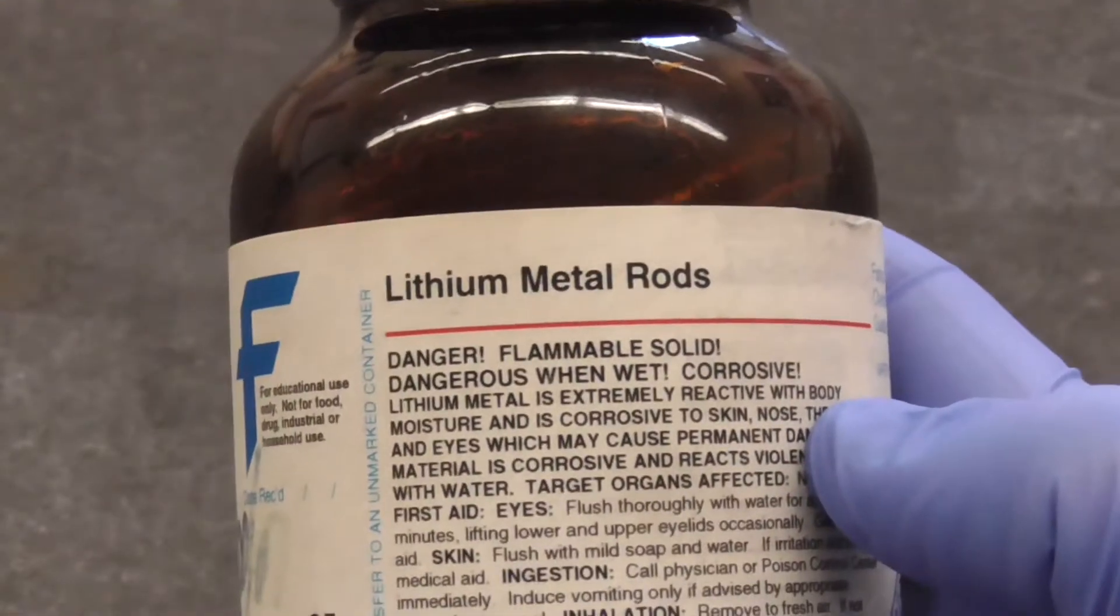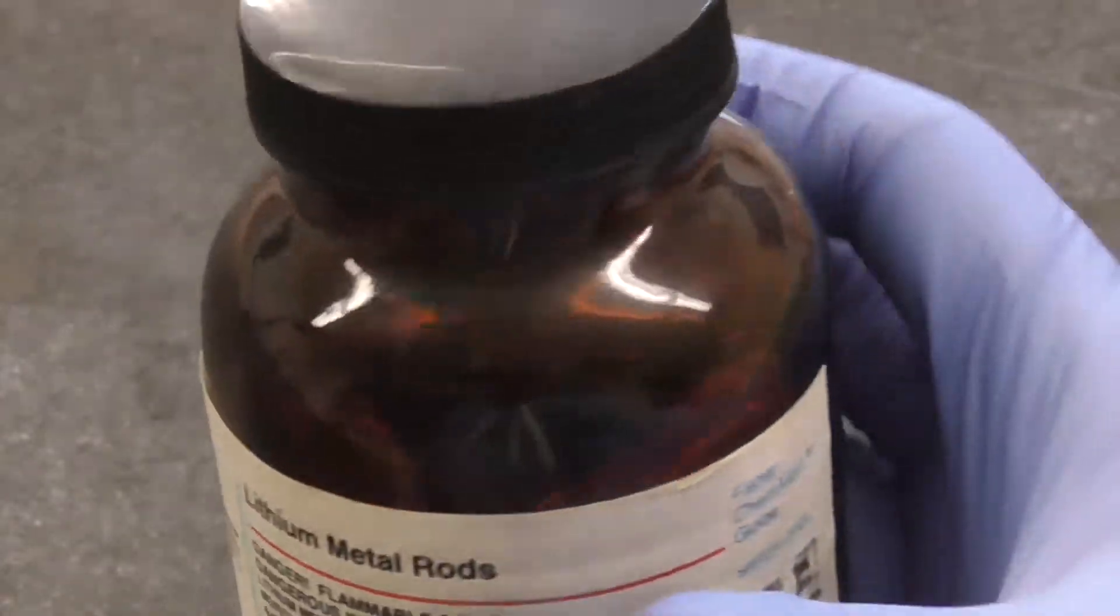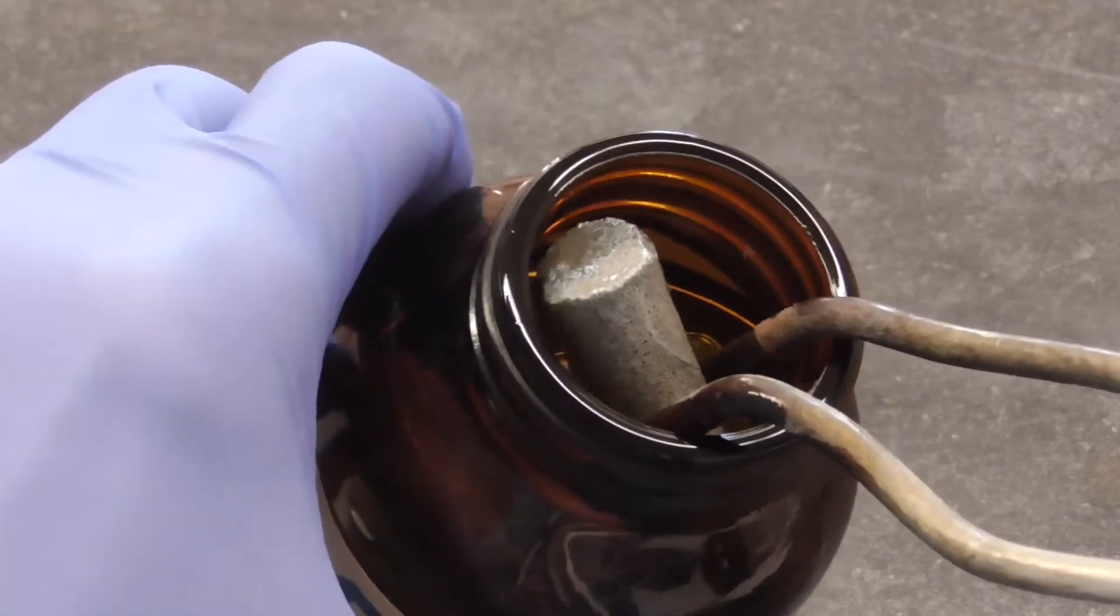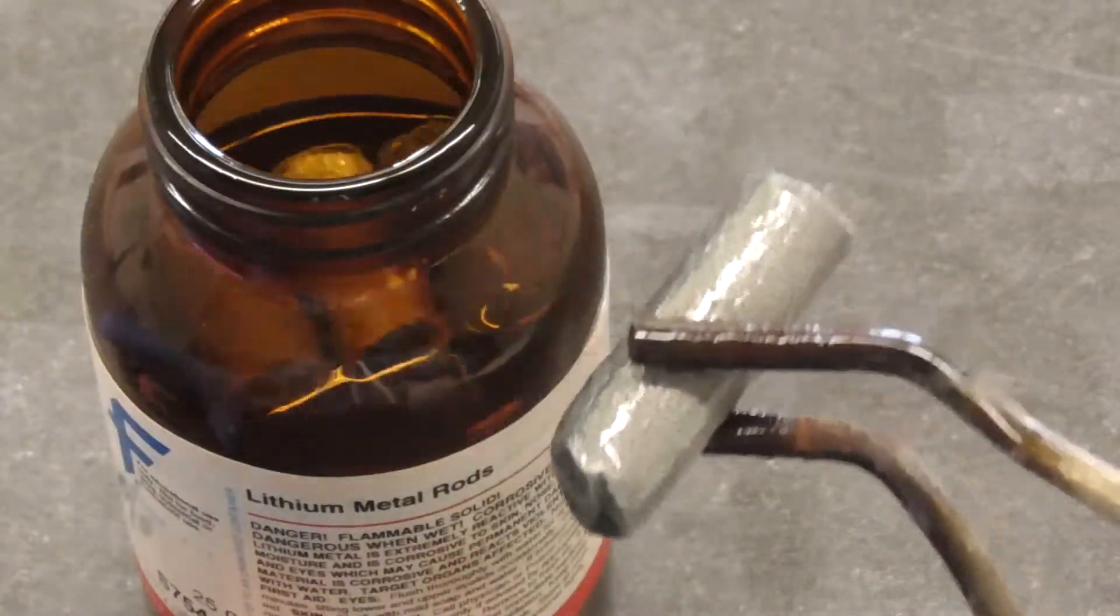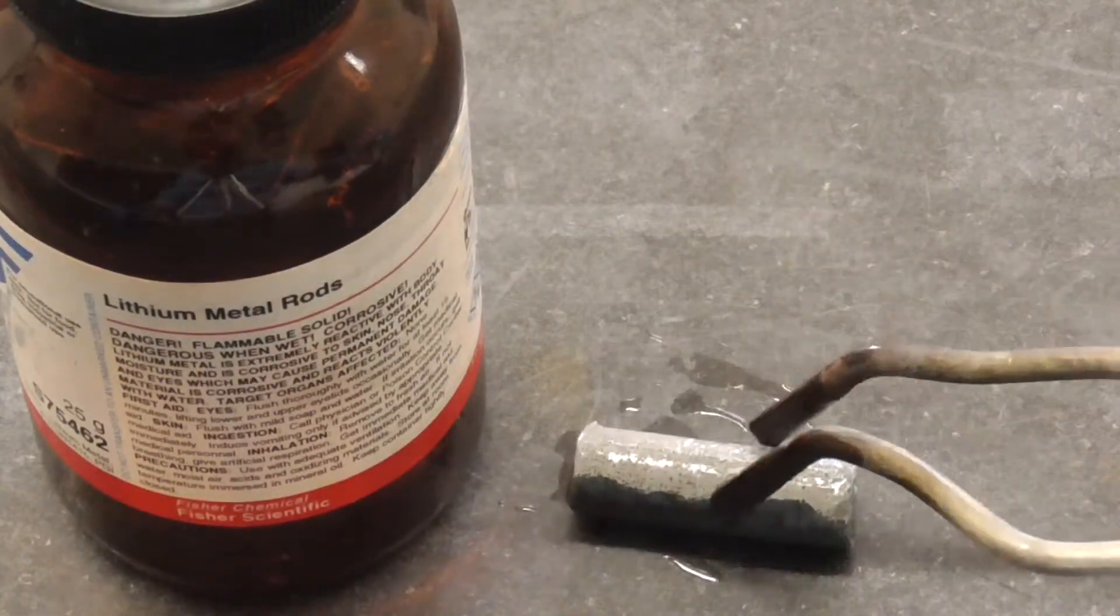Before I show you my attempts at doing so, I thought it would be a good idea to share with you some of the chemistry of lithium. Let's go ahead and take a metal rod of lithium out of this container and study some of its properties. Lithium metal is usually stored under oil in order to prevent it from reacting with oxygen in the air.